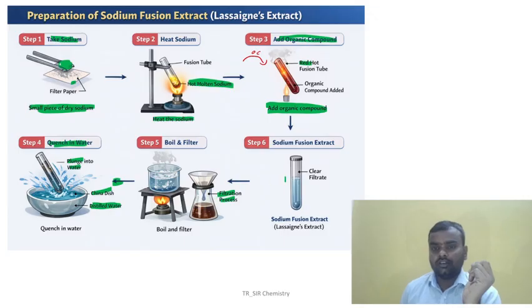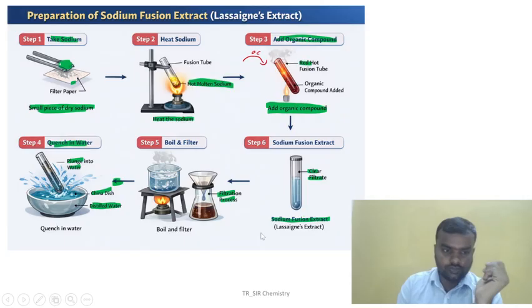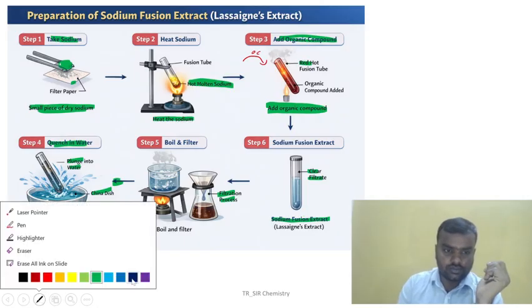After filtering, you will get the clear filtrate solution that we call the sodium fusion extract. Sodium fusion extract we are getting.